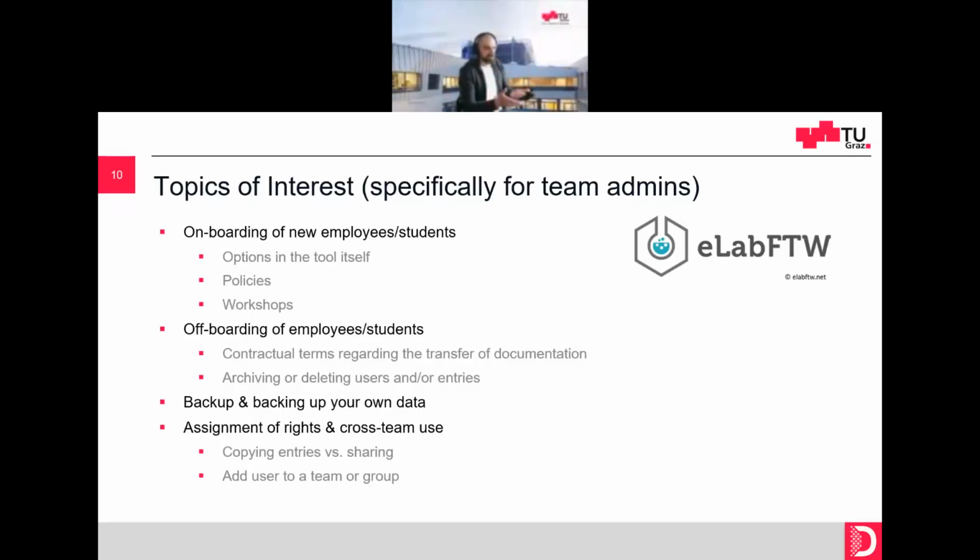But here as well, you have more things to think of, especially the permission part, or how to properly use tags, how we want to use our tool. It's a sandbox. It's up to you how to use it, so you have to come up with an idea. There is material out there which can guide you through this process, but as a team admin, you are responsible for your team, so you have to think how you want to use it.